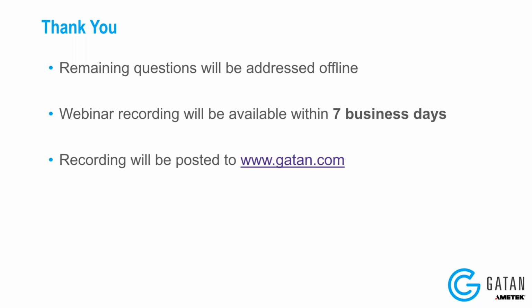In the biology world, it's huge because people are looking at proteins and small molecules, which are extremely beam sensitive. And so you need the sensitivity of a direct detection camera to do those kinds of experiments. And then within the materials science world, if people are looking at 2D materials or MOFs or other very beam sensitive materials, it can be a huge advantage to switch to a direct detection camera as well.